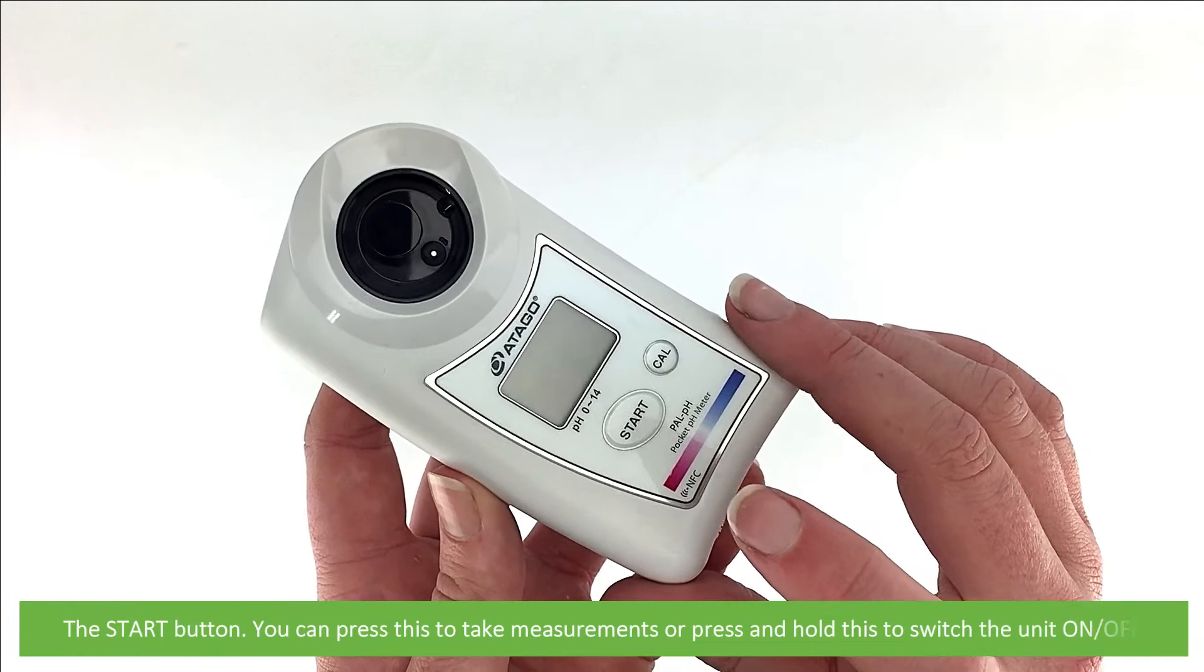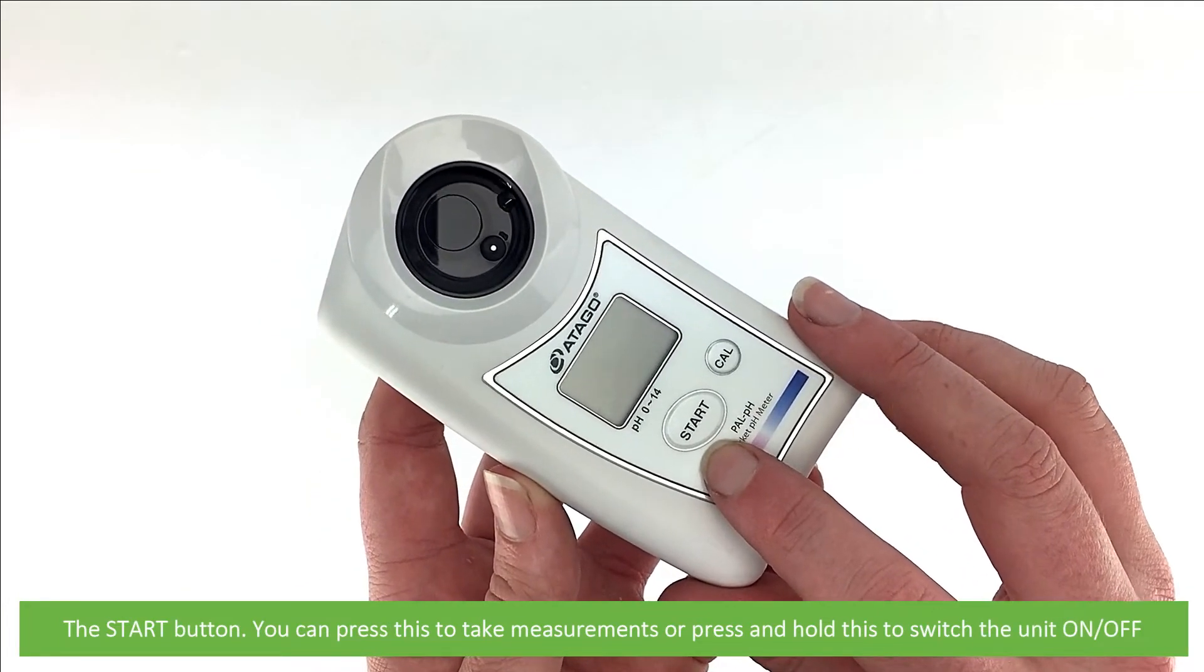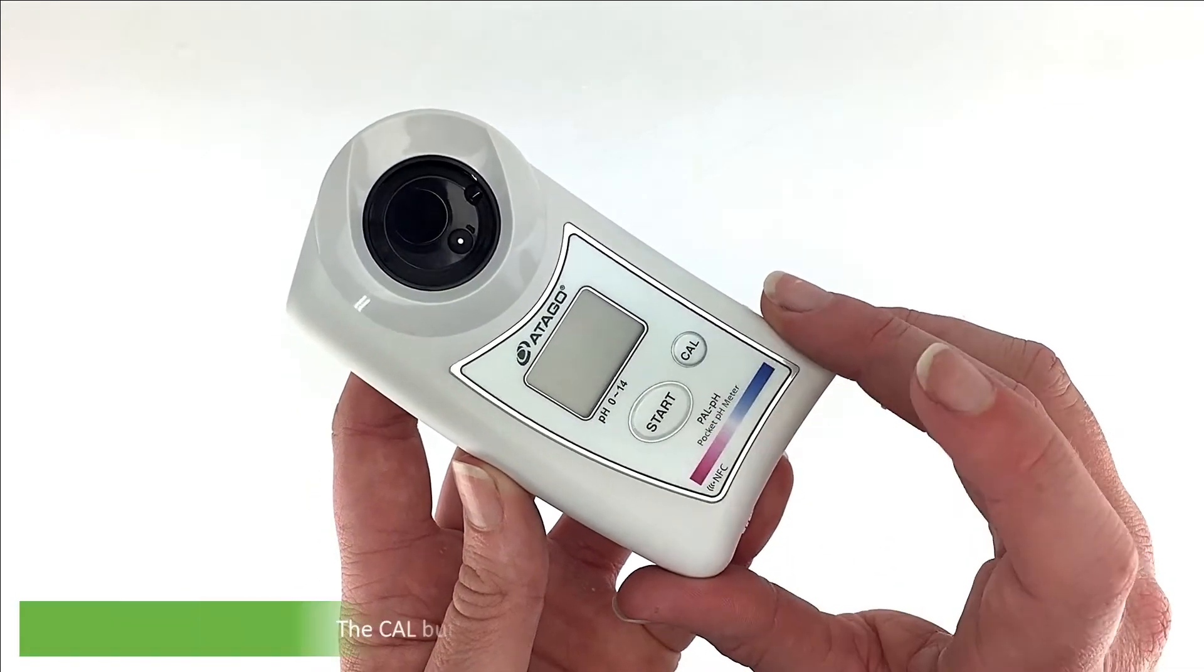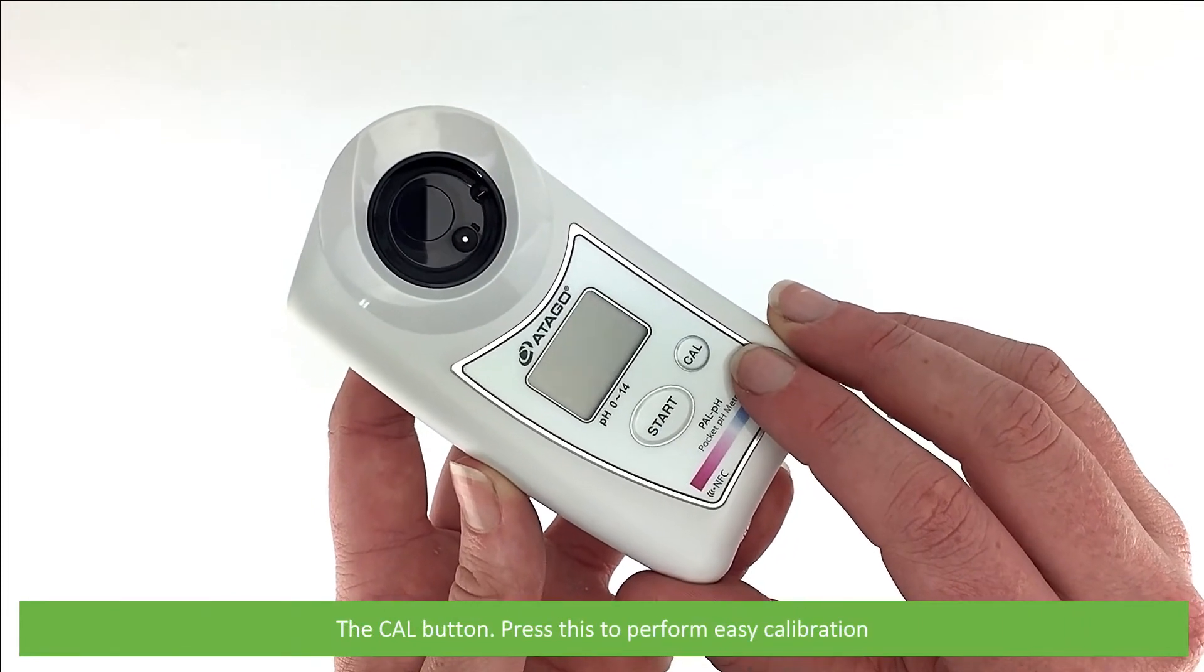The start button: you can press this to take measurements or press and hold this to switch the unit on or off. The cal button: press this to perform easy calibration.